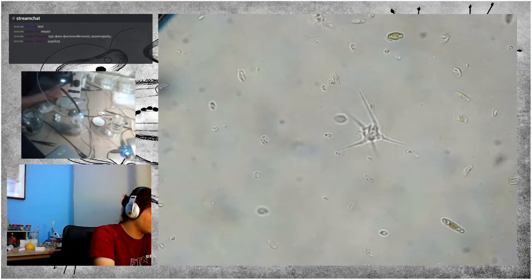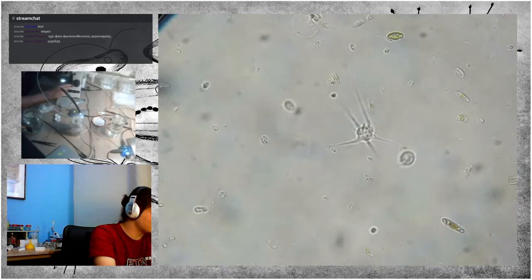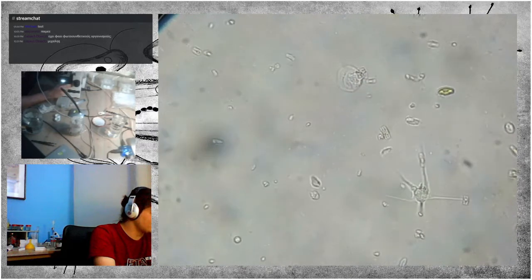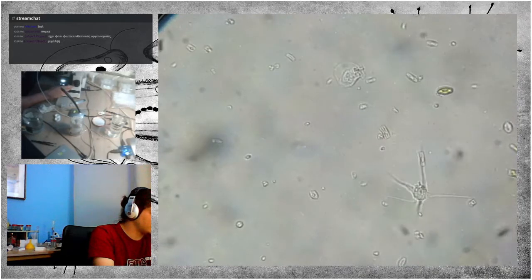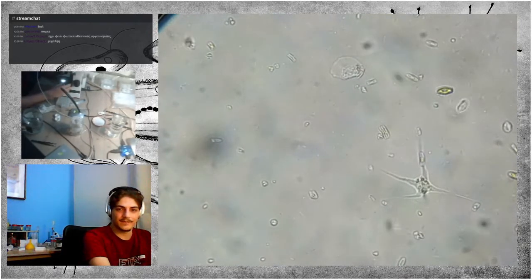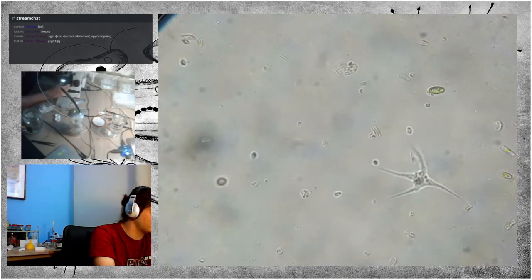and obviously around there are, at least I can see currents of bacteria. Unfortunately, the program that I'm using to transmit data from the phone's camera to the computer doesn't have that much resolution, so it's having a problem discerning some things.